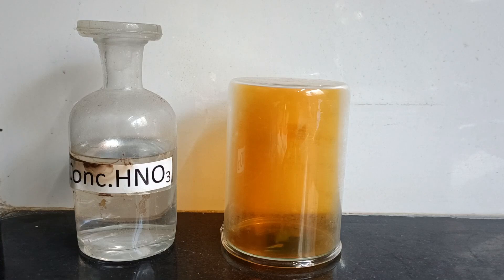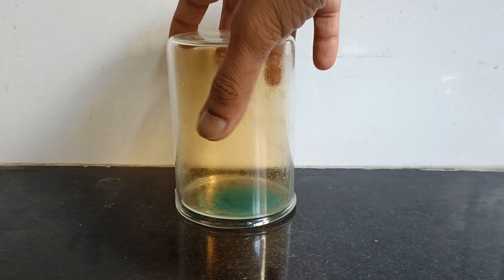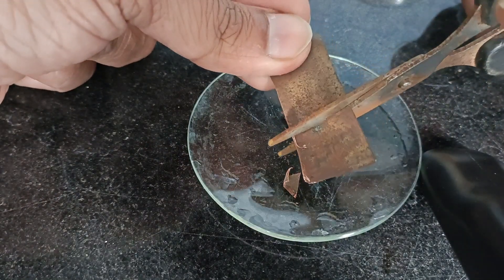The nitrogen dioxide gas starts to leak out from the spaces between the watch glass and the beaker. I tried to remove the beaker but unfortunately it got stuck. So I am going to carry out this experiment again in the open space without the beaker.